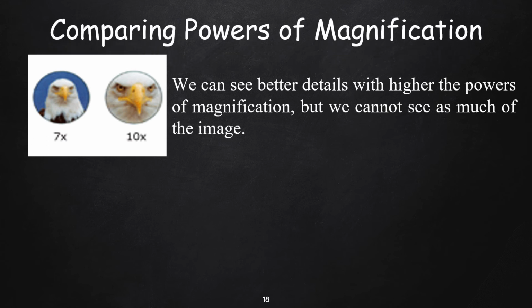This time, let us try to compare the powers of magnification. One thing that you should always remember when comparing powers of magnification is that the higher the resolution, the better are the details that you could see. But you would trade kung gaanong karami yung makikita mo dun sa image.